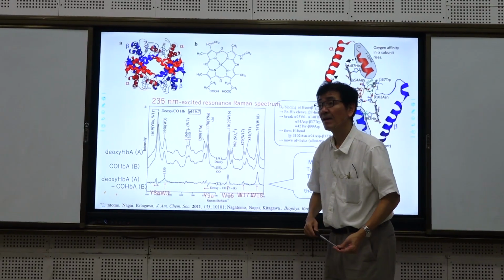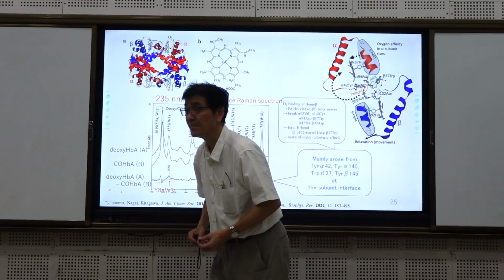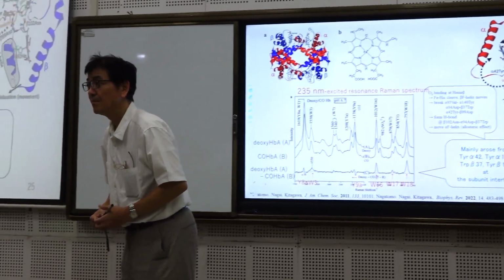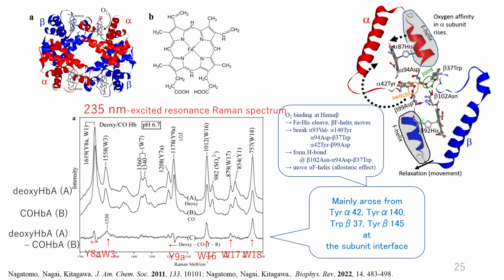Is it right to take the absorbance band as a guide to choose the excitation source for Raman? For a dye molecule, is it right to choose the excitation source where the absorbance band is? You mean, how to choose the excitation source? Can it be chosen from the absorbance spectrum? Is it right to choose from the absorbance spectrum?